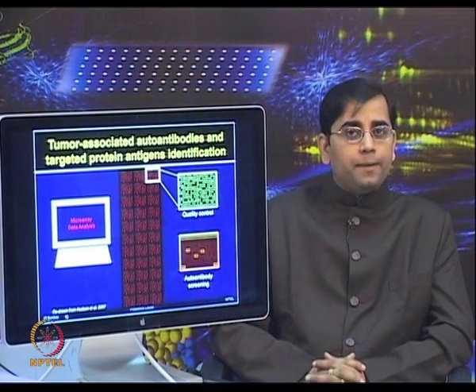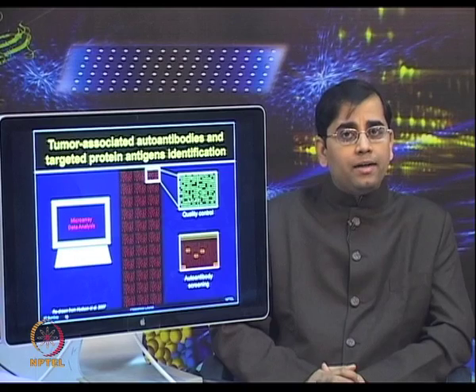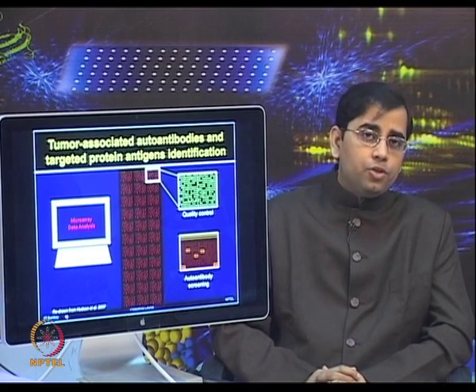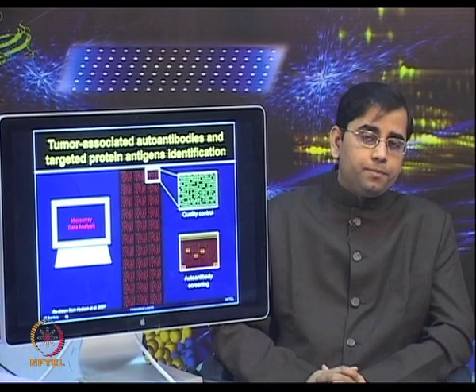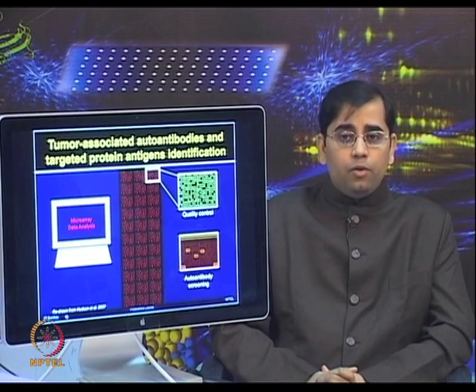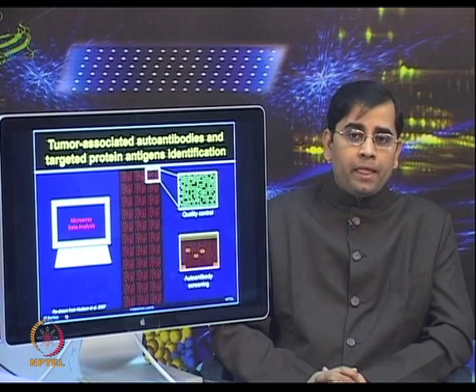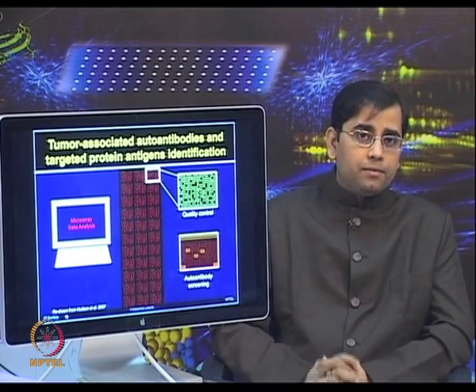Now, once the quality control experiment is done, then one can actually screen the different types of biomarkers using these chips. So, the authors then used the serum from the ovarian cancer patients and the healthy controls and then applied that on these human proteome chips. Now, the different boxes shown in the bottom panel on the right hand side indicate there are several positive and negative controls which were printed on these chips to ensure that the assay is working fine. And then there are certain proteins shown in the center which are potential markers.